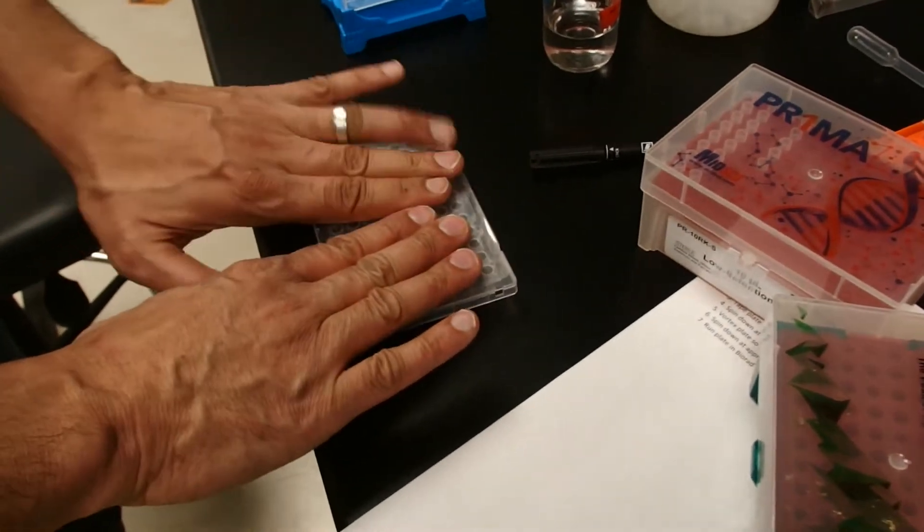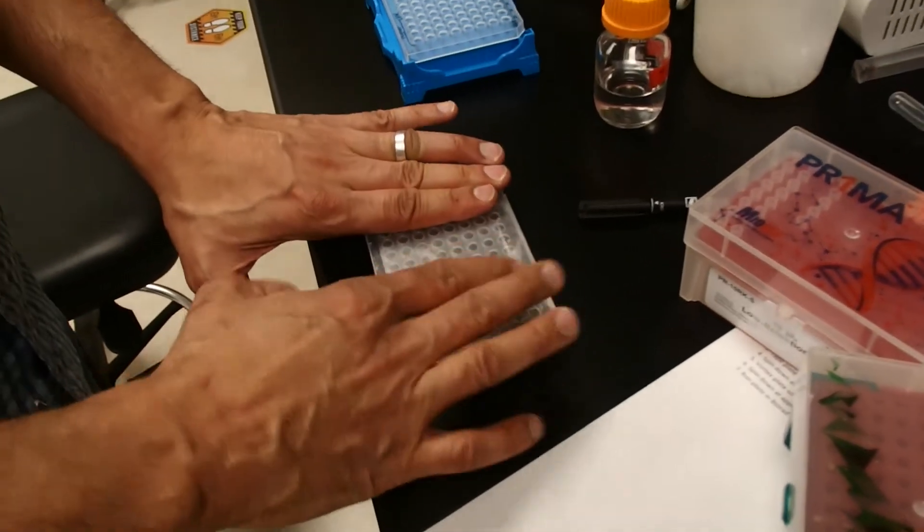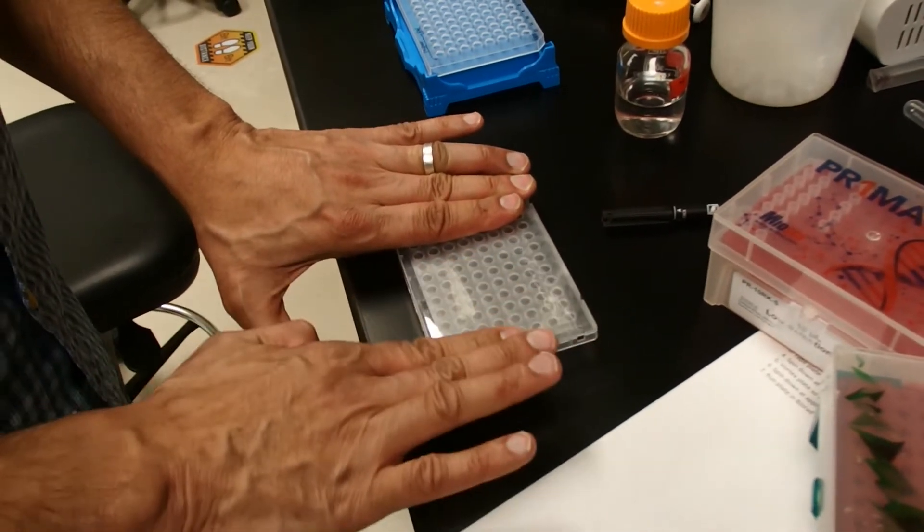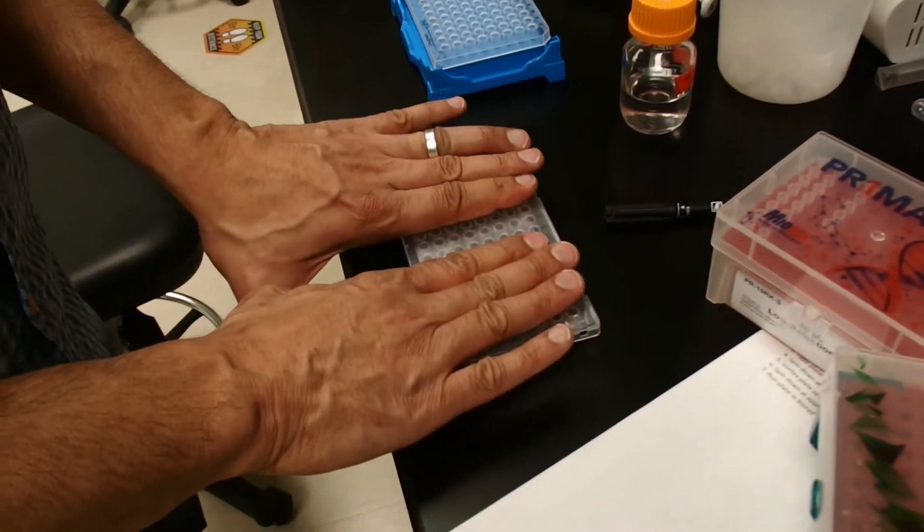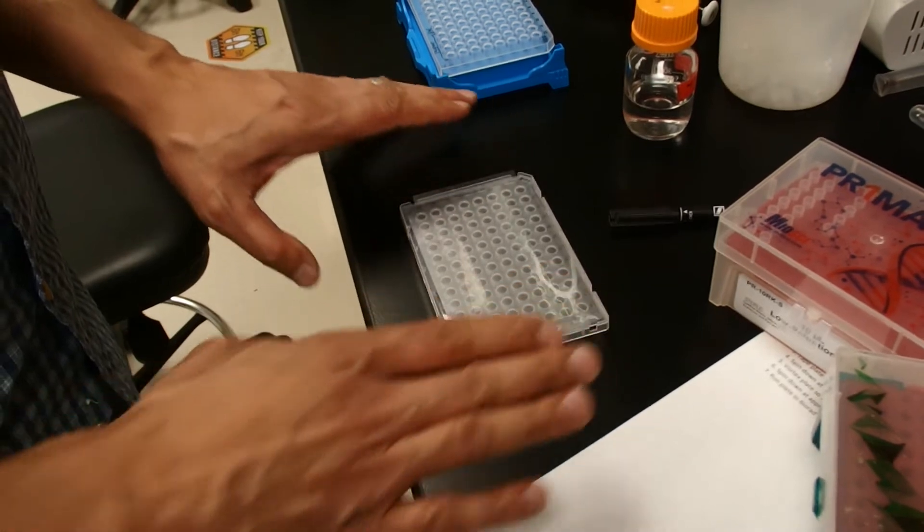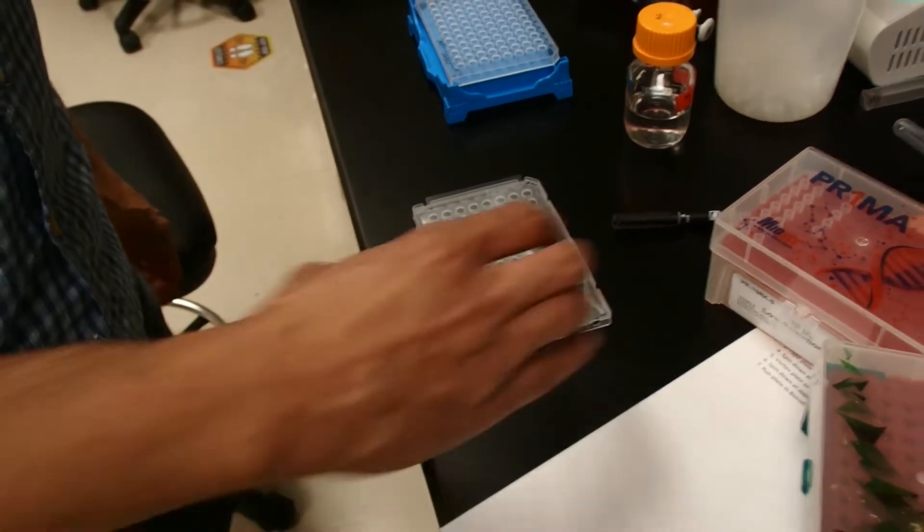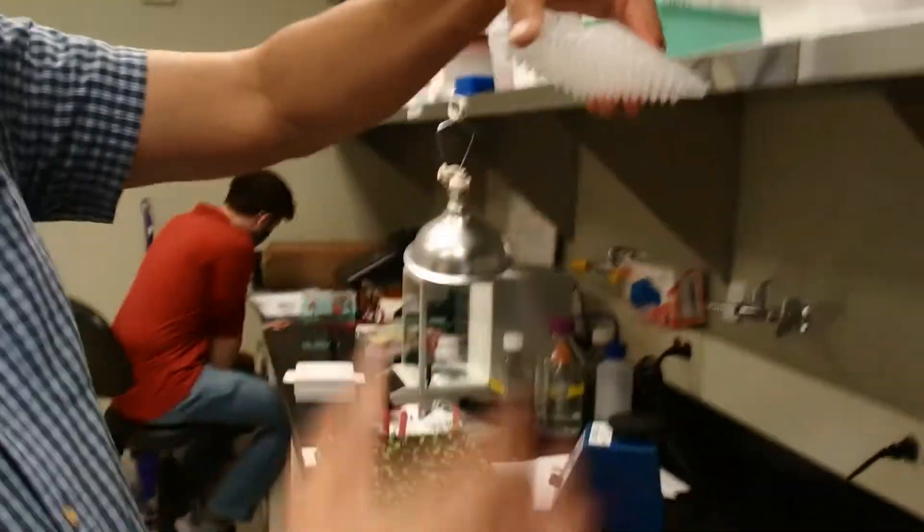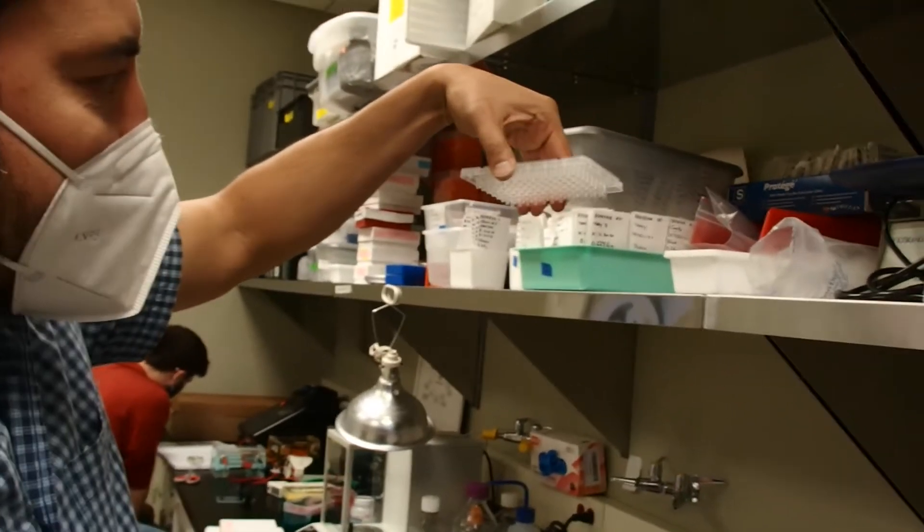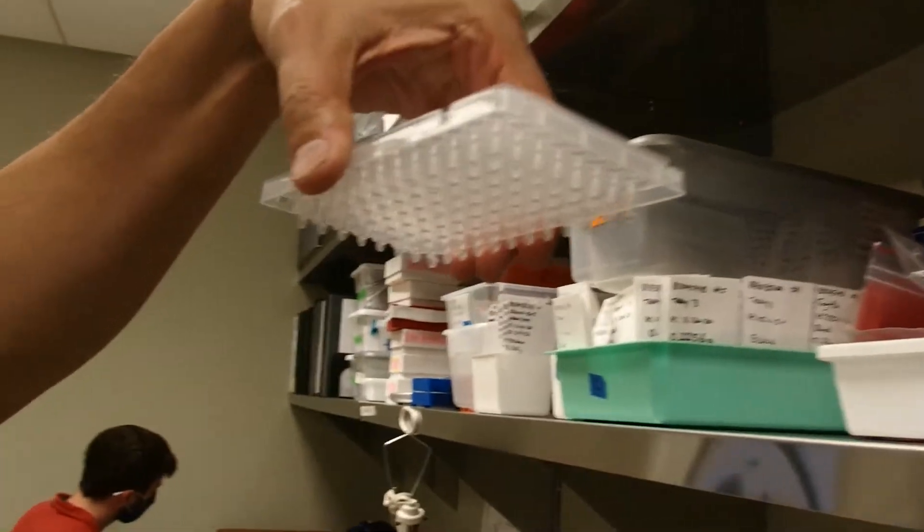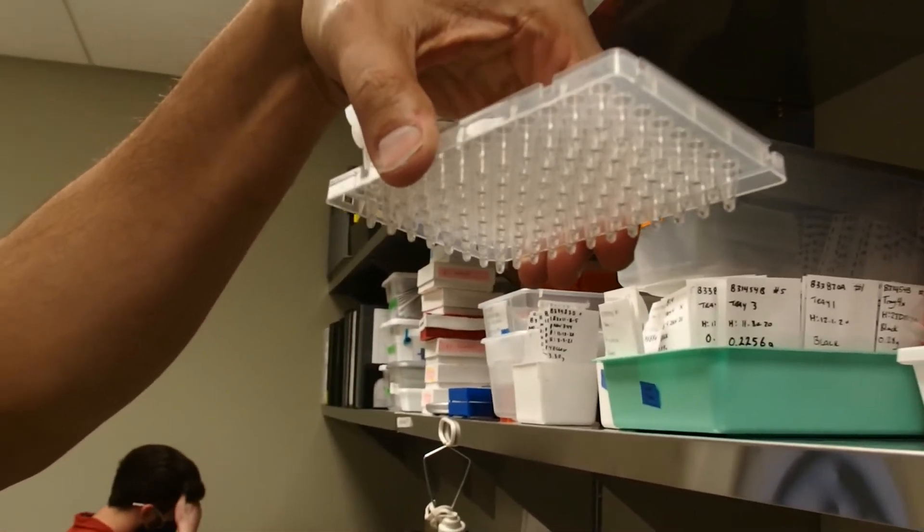This is what I have found is the best way to seal a qPCR plate. They have spreaders and all these things, but just a human touch seems to do a better job of sealing all the wells. Now we'll take this guy and we'll vortex it, spin it down, vortex it and spin it down again.